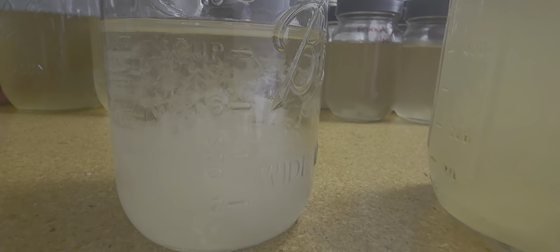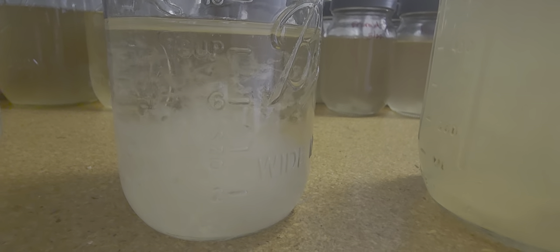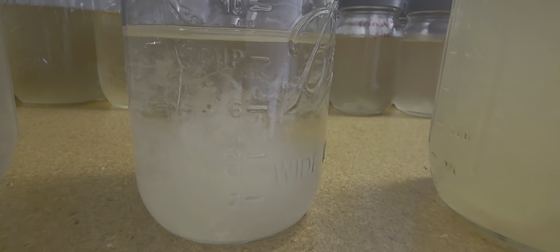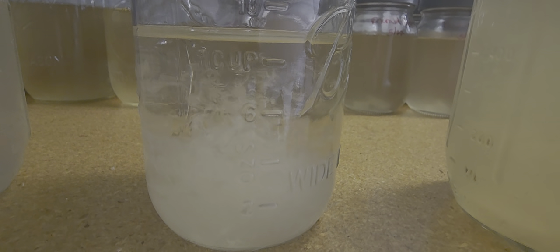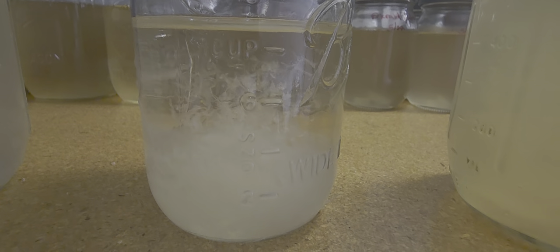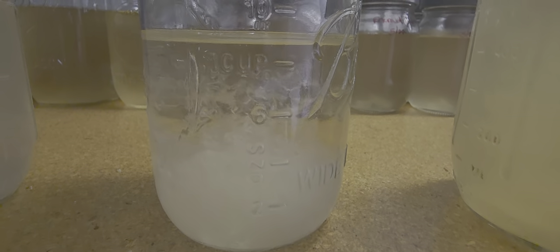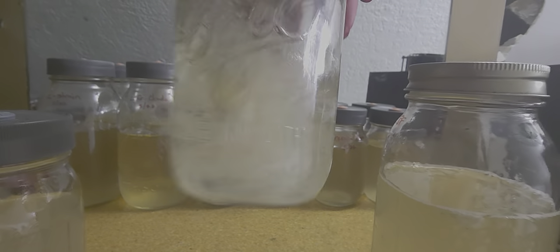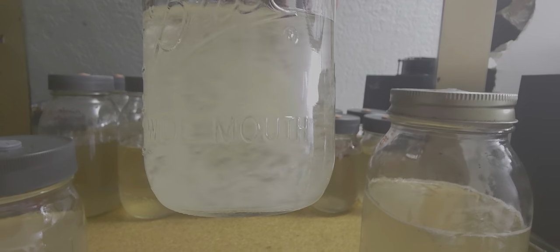That is a non-contaminated, great looking culture. See how she separated back — clear as day. That is what you want when you are looking to check if your liquid culture has been inoculated and is contaminated or not. You want your liquid cultures looking like this, folks — perfect, clear water even when you shake them up. Crystal clear, beautiful.